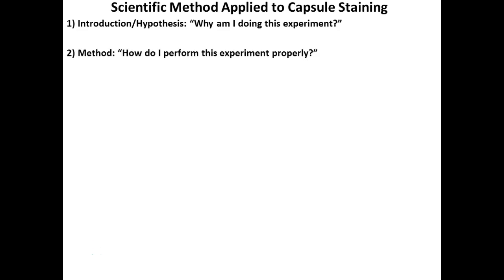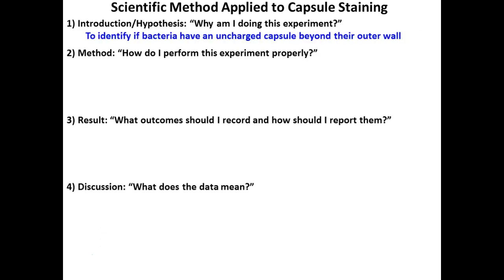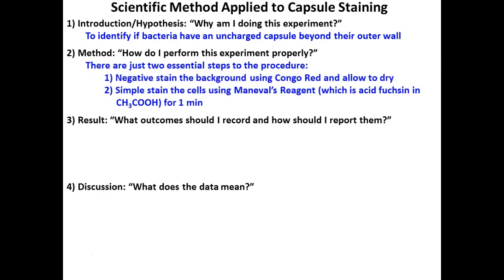So why are we doing it? Well, we want to know if they have a capsule or not, right? How do we perform it? You've got to do all steps. You've got to do your Congo red. You've got to let it dry. You've got to do your Maneval's reagent, blot it dry, and look at it. We're going to record our results, right?